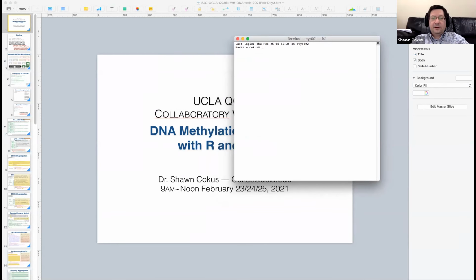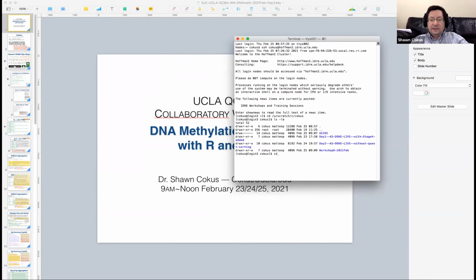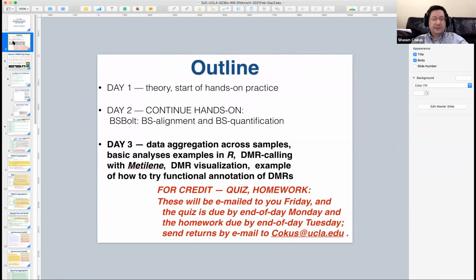All right, so start up your Hoffman if you haven't already. All right, and change to my scratch space. And there's a copy of day 2 now that's got sort of everything settled from what happened, just sort of cleaning up from what we did there.